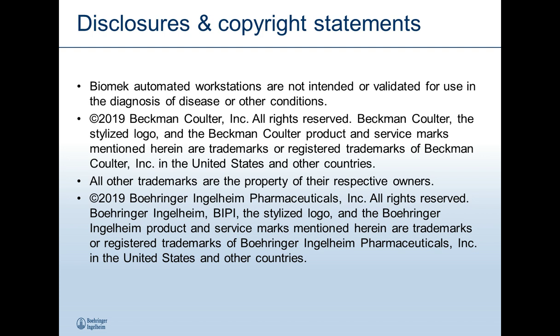The best way that I can think to go about something like that, and it does take a bit of familiarity with the components you're working with, is looking at your process and identifying the possible causes, and then changing one variable at a time across your process to identify what part of that automation process is your culprit, so to speak.